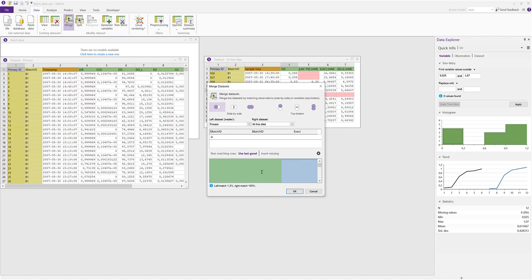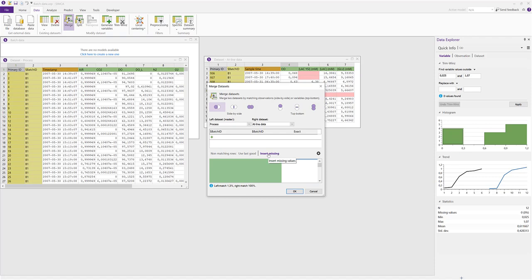If you look carefully, there are actually two shades of blue. A darker shade at the top indicates where we have a match, and the lighter shade is everywhere else. This lighter shade is because by default SIMCA will fill in the last good value after each matching row. Selecting insert missing will leave only the darker blue, the matching rows indicated.